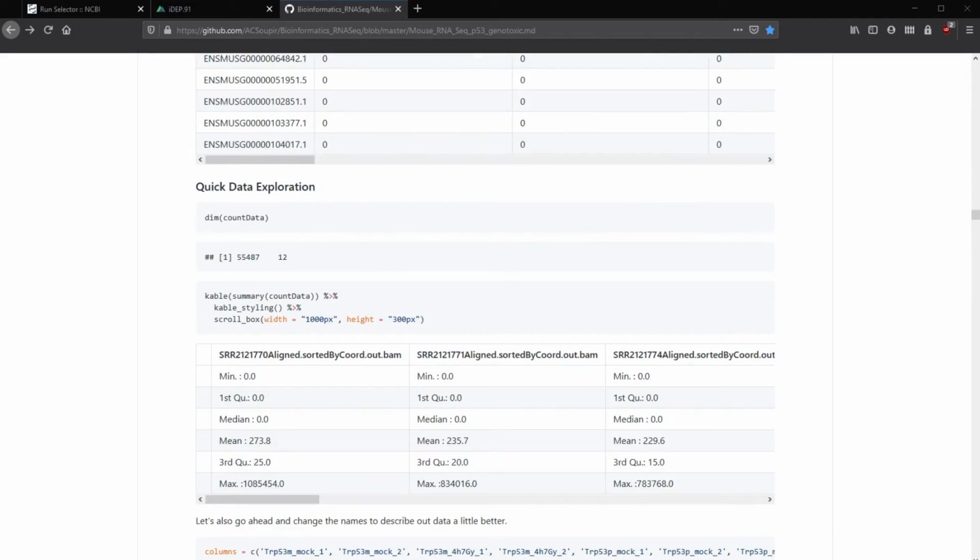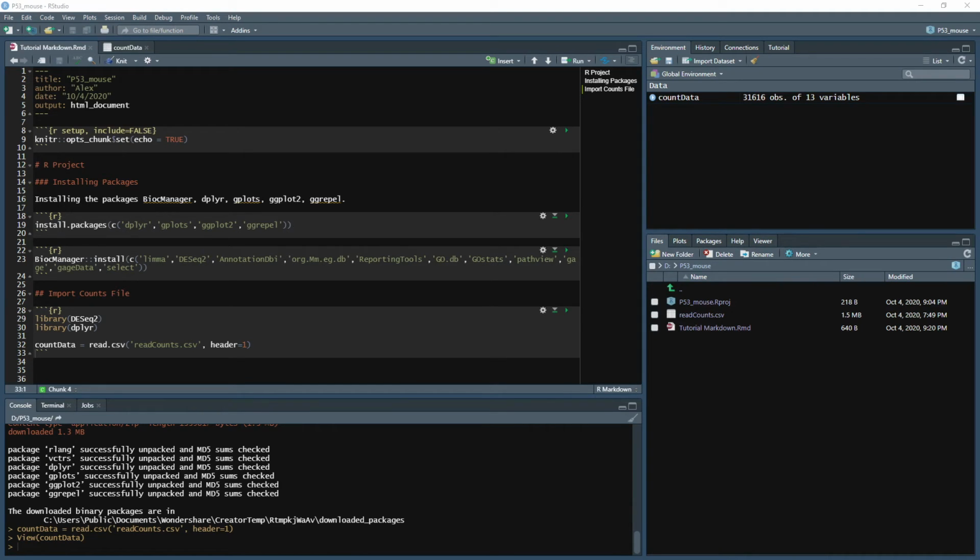So something that I could quickly mention, if we go back to R, here we go, is that this is called Markdown, and you can look up an R Markdown explanation to find out what all of this is actually doing. But the nice thing about creating a project versus just having a random R document with a ton of different tabs up here from different projects is that it keeps everything really organized.